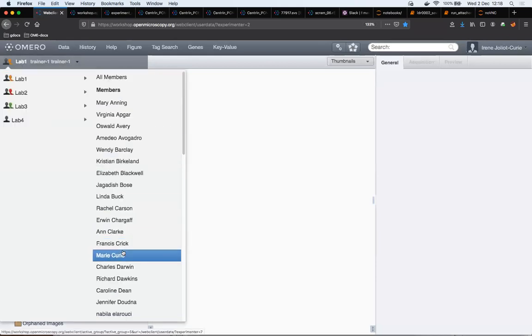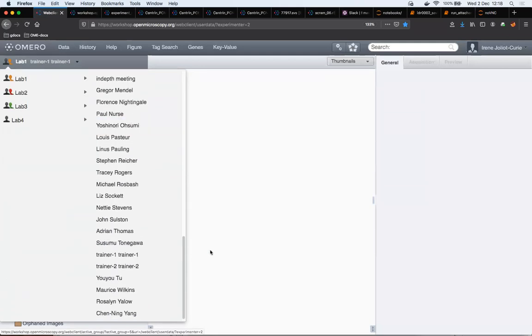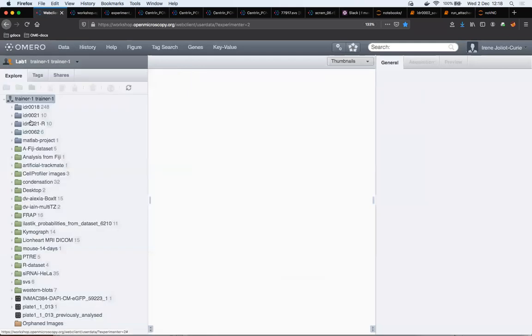What we are going to show now is a tool called OMERO.parade, which is a data mining tool, and we will show how to go through the images which are stored in OMERO based on the qualities of the images, such as those coming from the results tables, coming ultimately from our analysis in Fiji.